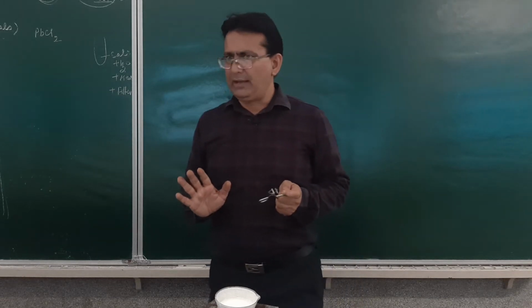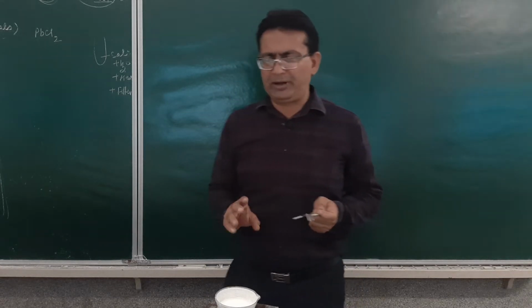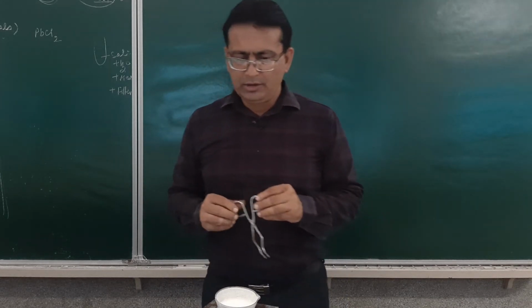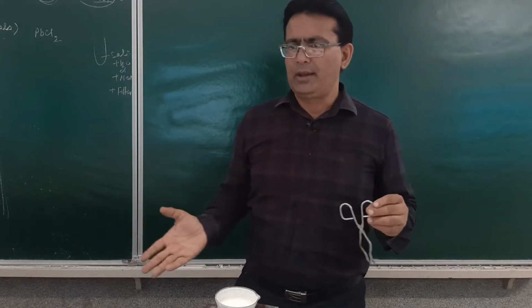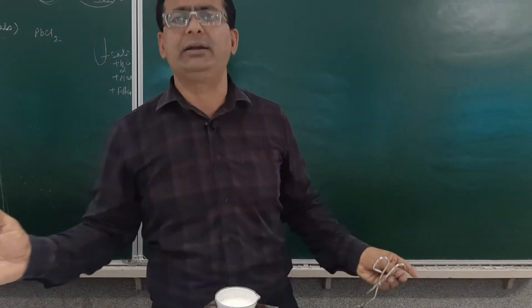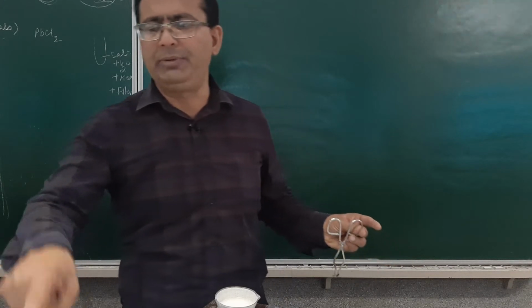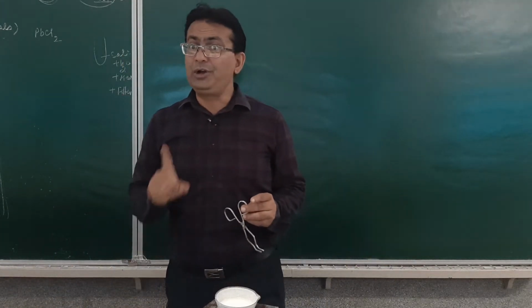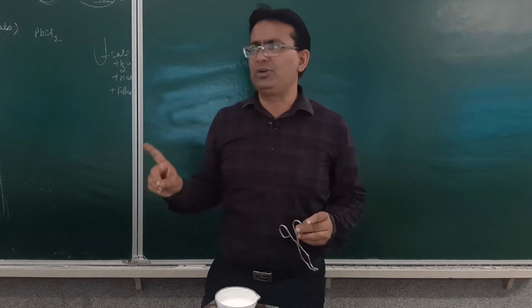Am I clear? You have to carry out the practical with utmost confidence. Then once it gets heated up, I will filter. The residue for the anions is to be discarded, and the filtrate will be called the sodium carbonate extract. It is in that filtrate that I will be carrying out the test.